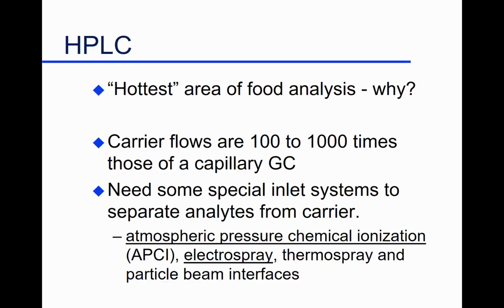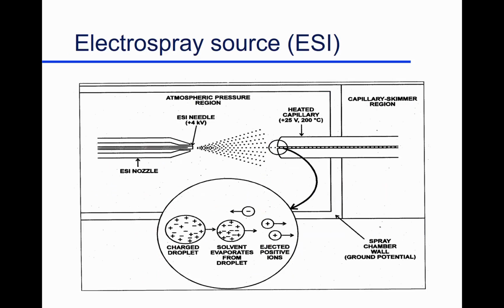So we're really interested not in what's in your food. We're interested in what's given up by your food during the eating process. And it's a tremendous technique for that. It gives us the ability to look at those relationships between people and perception and stimulus. It's a fascinating tool for us. But okay, getting back to LC, since that's the topic. There are different techniques: electrospray, thermospray, particle beam interfaces. Again, different ways of looking at those, getting rid of the mobile phase.